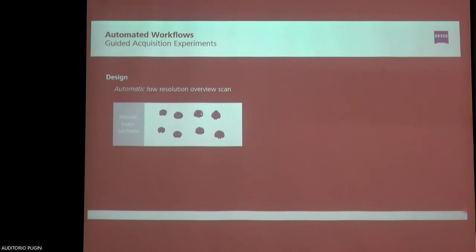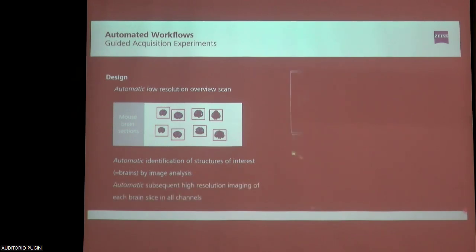And then the system finds these regions of interest and just extracts the coordinates and then, for instance, is doing an automatic super resolution Z-stack. So the idea is that you need to invest some time to train the machine to do that, to set up your experiments and your image analysis. But in the end, you do your sample preparation, you put it on the microscope, you click one button and you go and have a better work-life balance. Yeah, that's basically the idea of it.